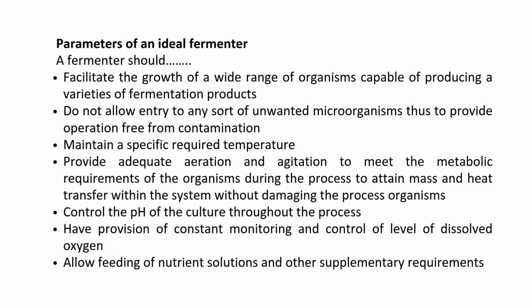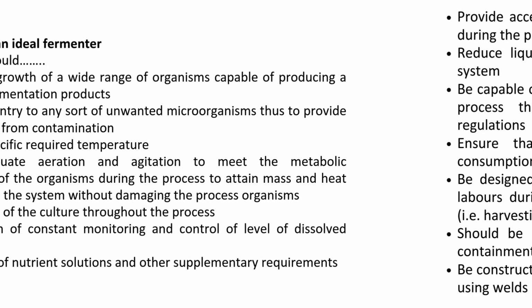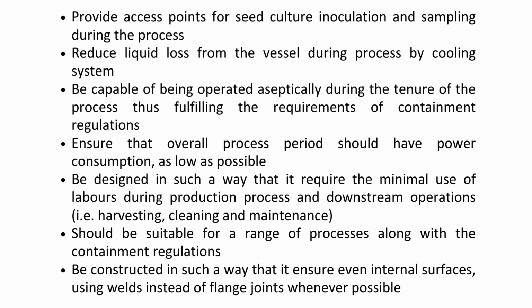This meets the metabolic needs of the organisms and achieves mass and heat transfer without damaging them. It must control the pH of the culture and allow for constant monitoring of dissolved oxygen. It should also allow for the feeding of nutrient solutions and other supplements. Furthermore, a fermenter should provide access points for inoculating the seed culture and for taking samples during the process.